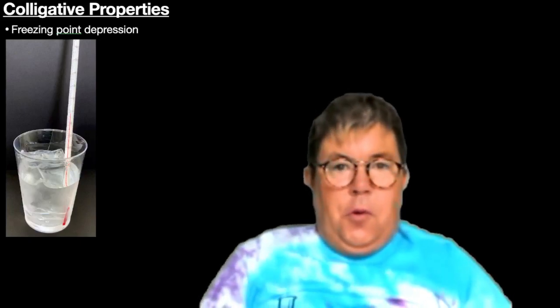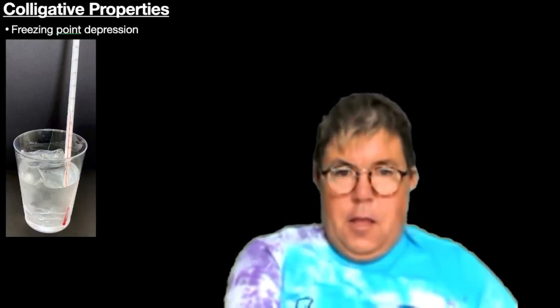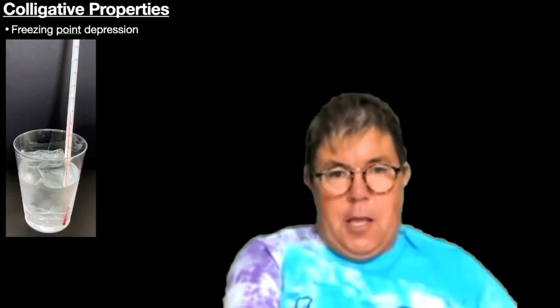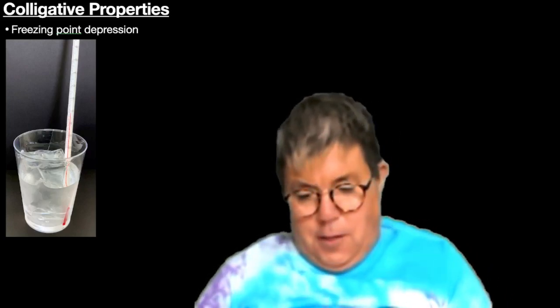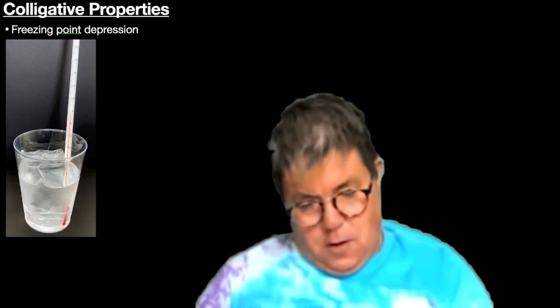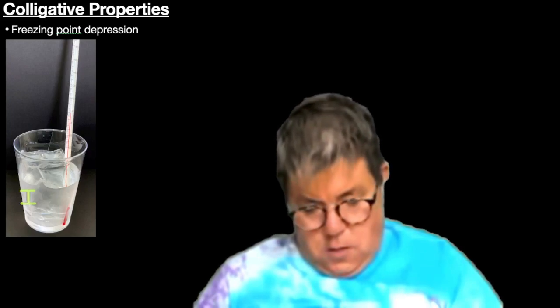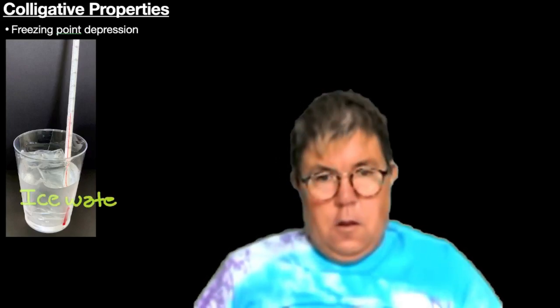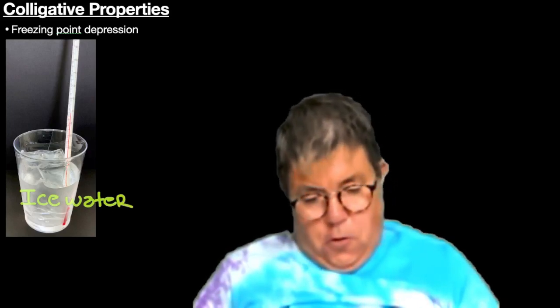What you are going to do in this experiment is take a cup, and you're going to have in the cup some ice, water, and you are going to measure.